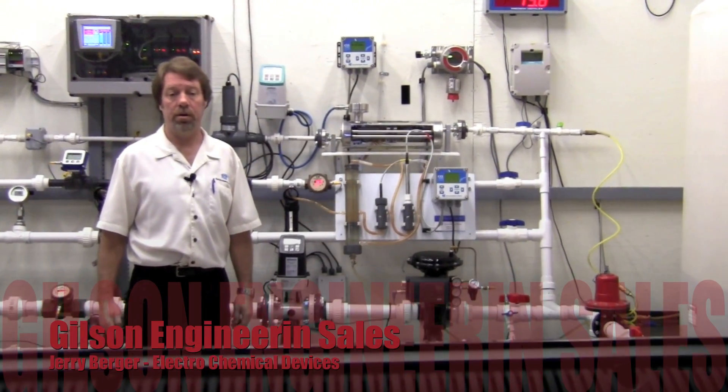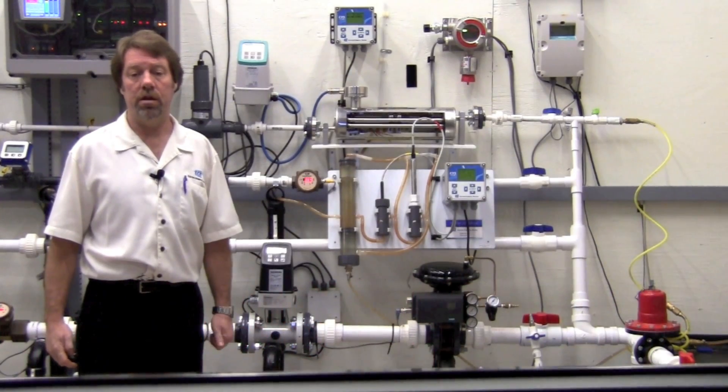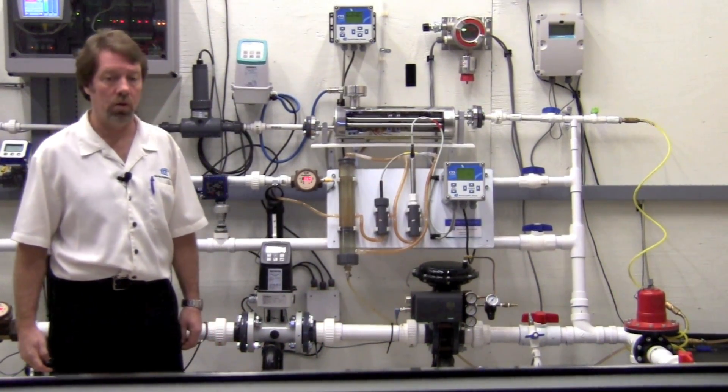Hello, my name is Jerry Berger. I'm from Electrochemical Devices. I'm here in the Gilson Engineering Flow Lab and today we're going to talk about the ECD chlorine systems.